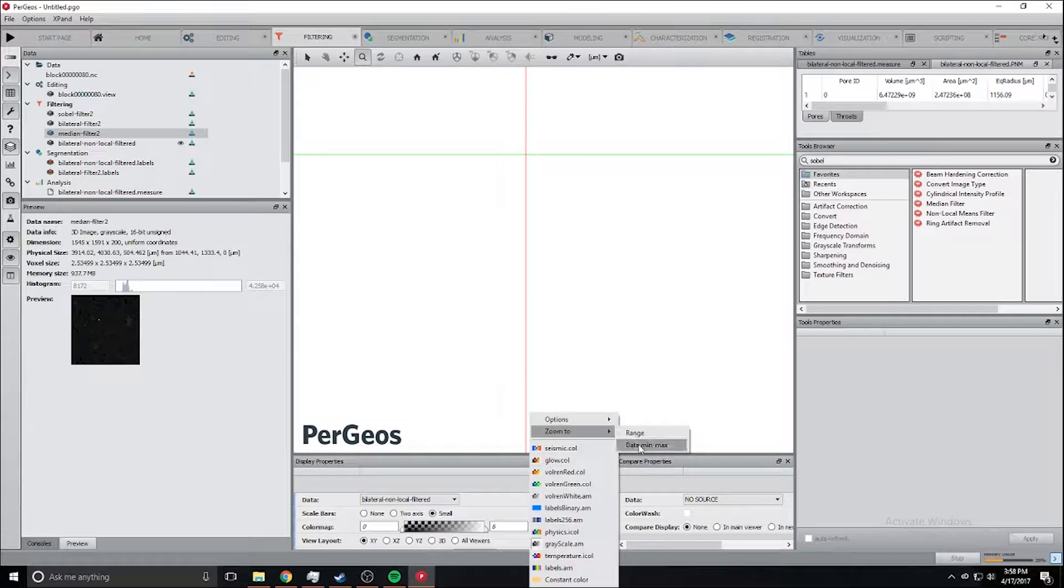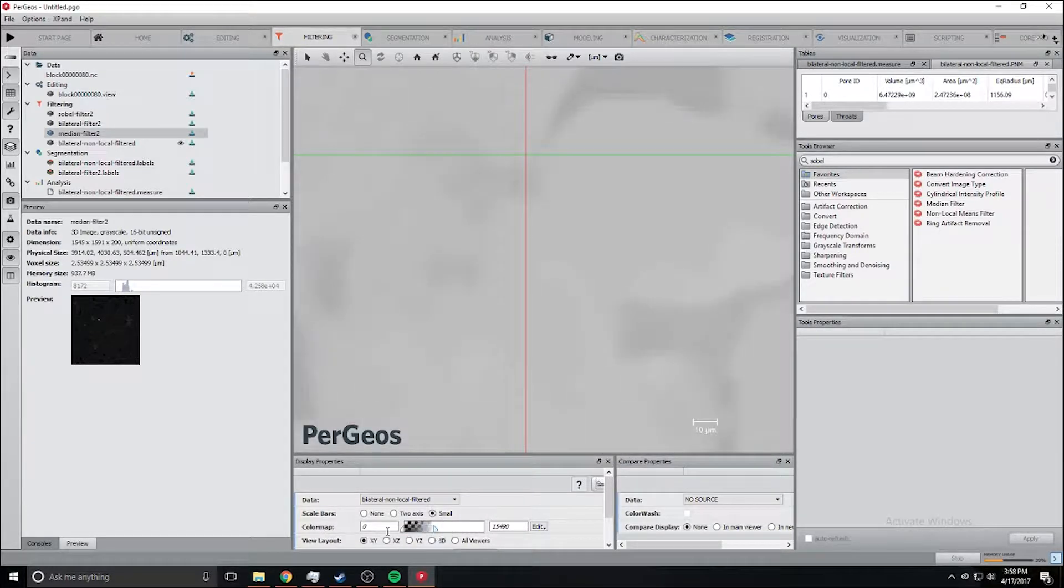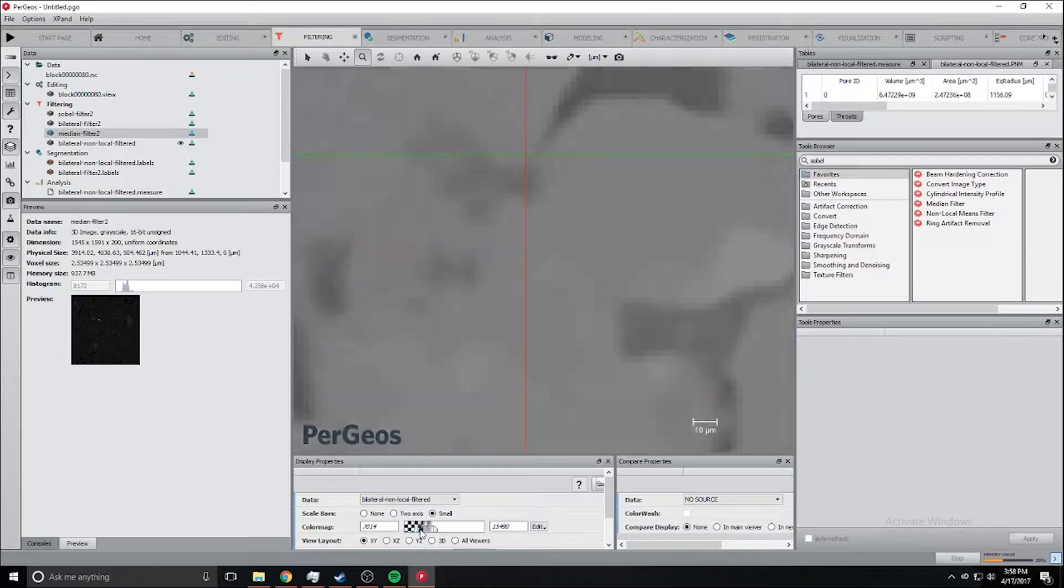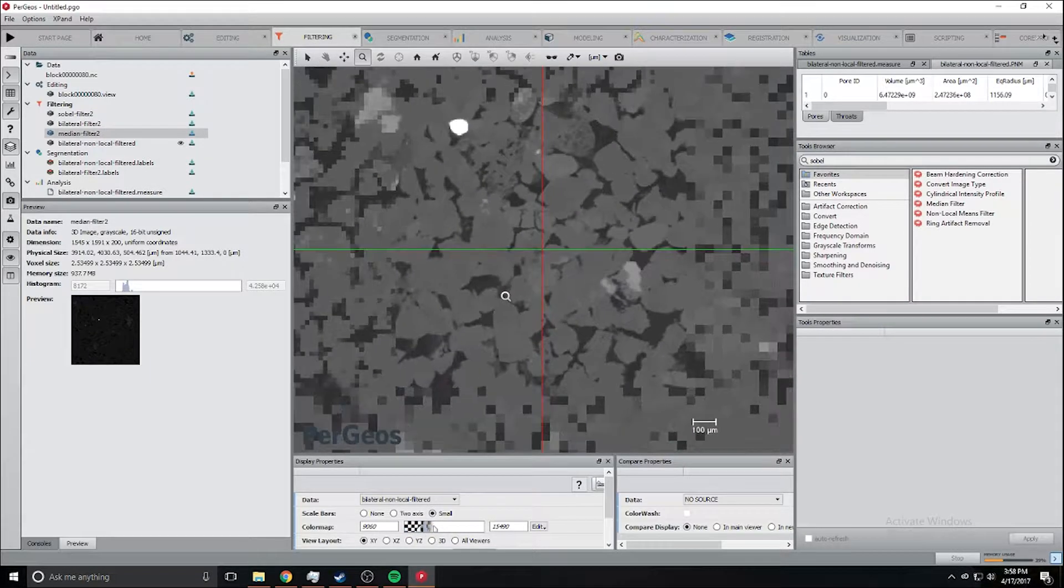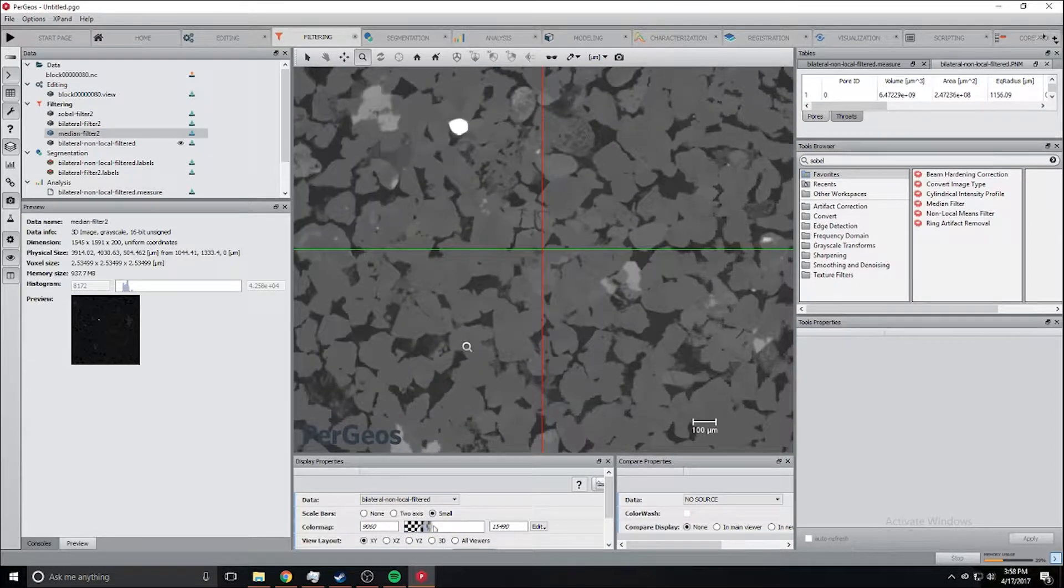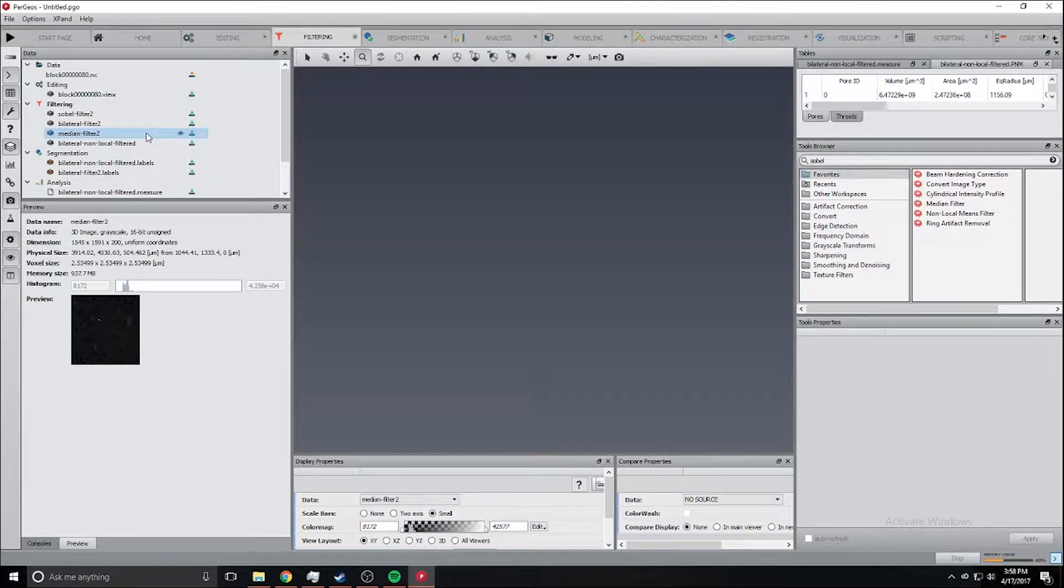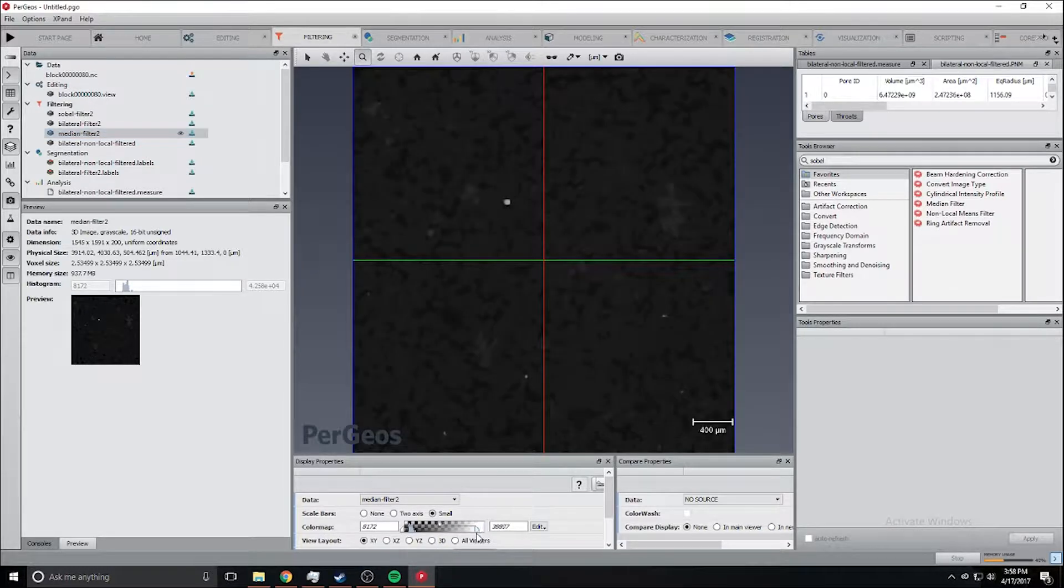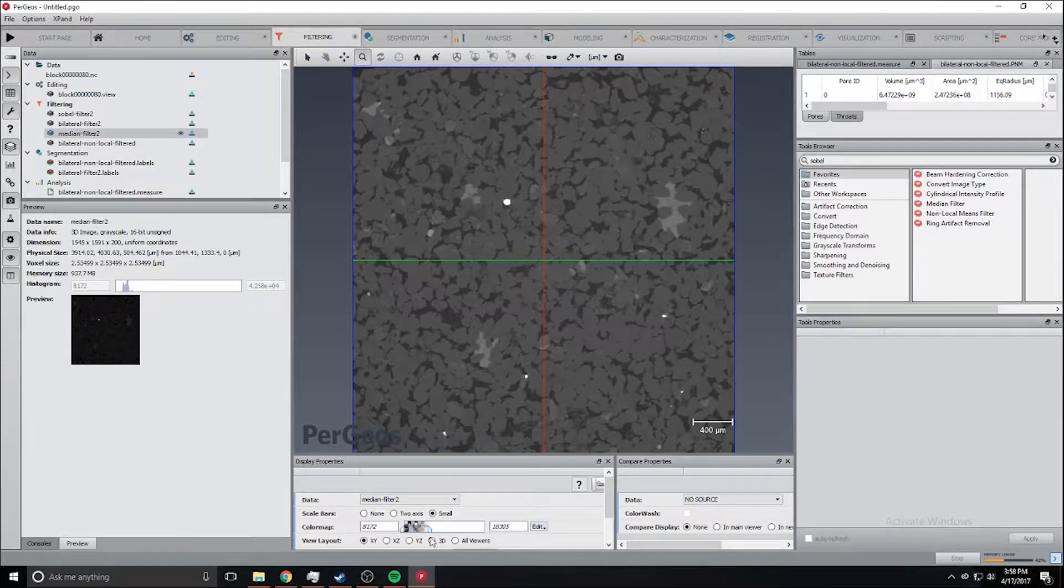We want to zoom to data main max so we can actually see what we're looking at. We first want to view the median filter.